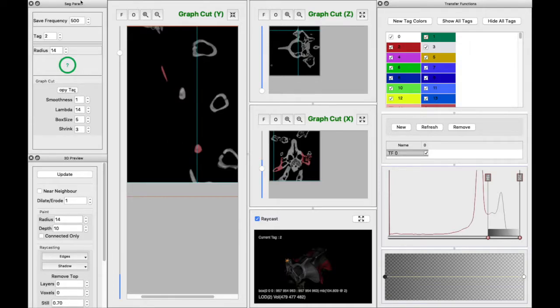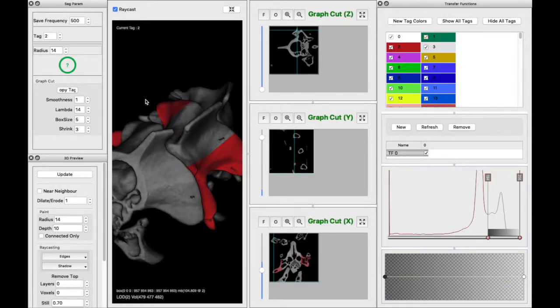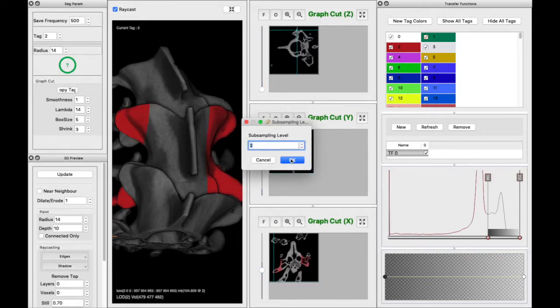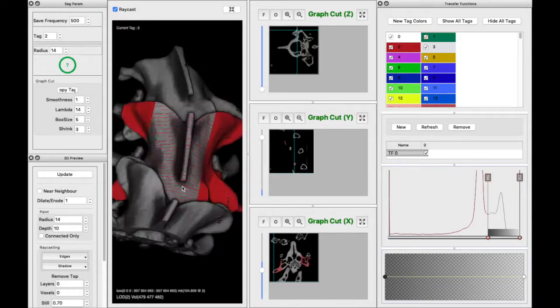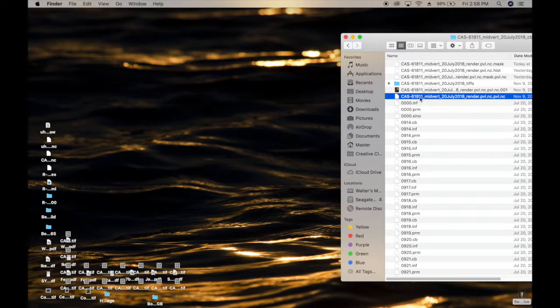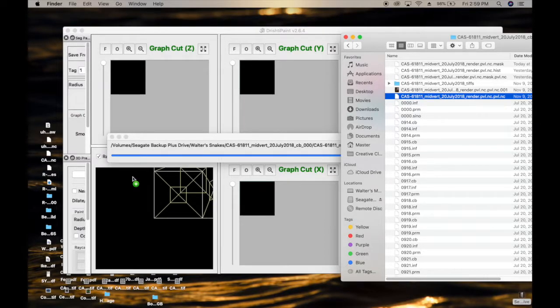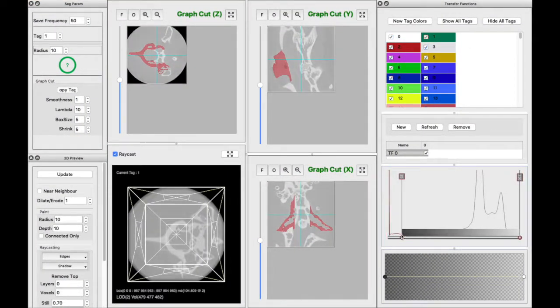So, let's do a quick save and check how things are looking on the 3D view. Oh, what? It doesn't look like it has much changed at all. Let's hit the update. And, oh, we get that nice candy cane pattern. So, I think it actually is worth seeing what we have done and what we still need to do to go ahead and quit and then just reopen it again, and hopefully it'll get rid of the candy cane, because we need to see the areas that we should, one, go back and redo, and two, the problematic condyl area.